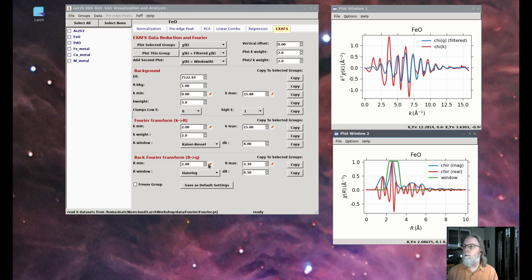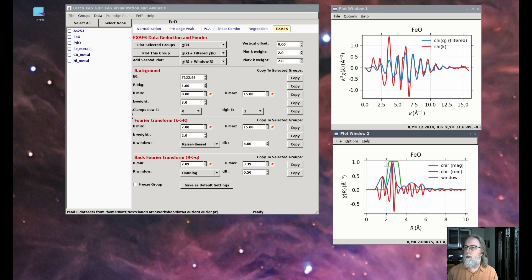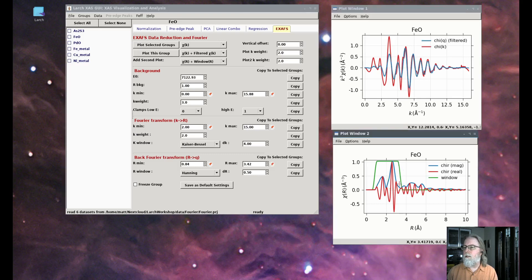For iron oxide, that would be the iron-oxygen shell and the iron-iron shell. One thing you may notice is that the iron-iron oscillations persist out to higher k than the oxygen oscillations. The oxygen oscillations peak up around 3 to 6 inverse angstroms, whereas the iron-iron oscillations peak up at higher k — around 6 to 8 inverse angstroms. That's a feature of the scattering properties of elements: higher-Z elements tend to scatter out to higher k.